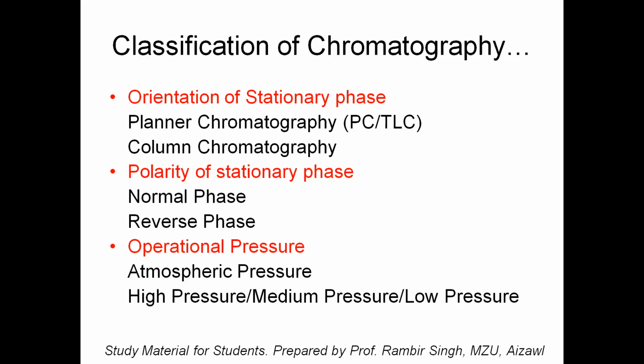In reverse phase chromatography, the stationary phase is non-polar in nature. So how can it be done? You can have a stationary phase which is non-polar in nature.